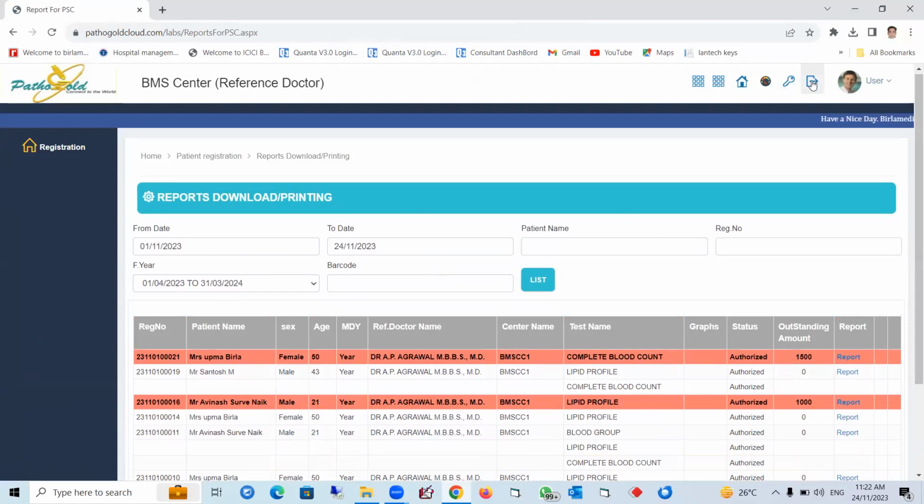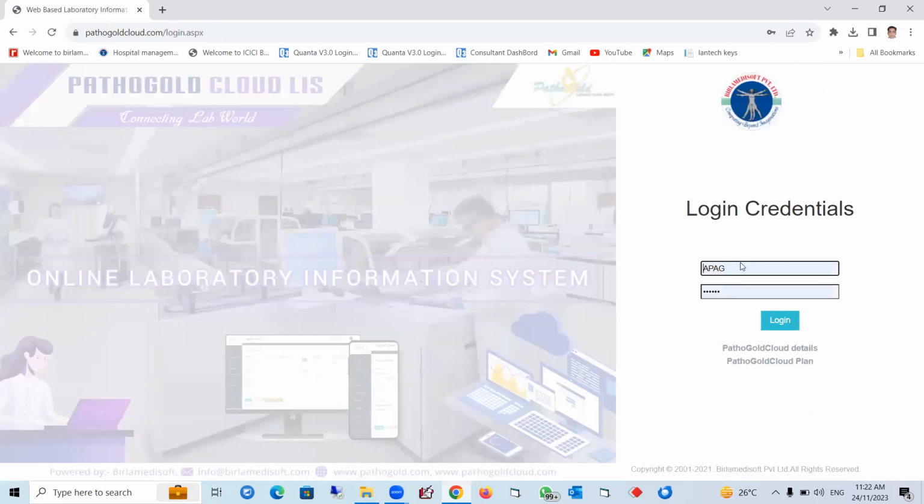So every referring doctor can have complement rates, and referral charges can be defined separately for them. For every doctor, we can define the referral charges. Now let's study another concept called source.